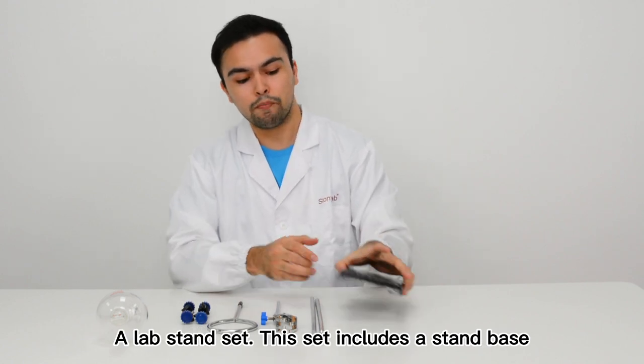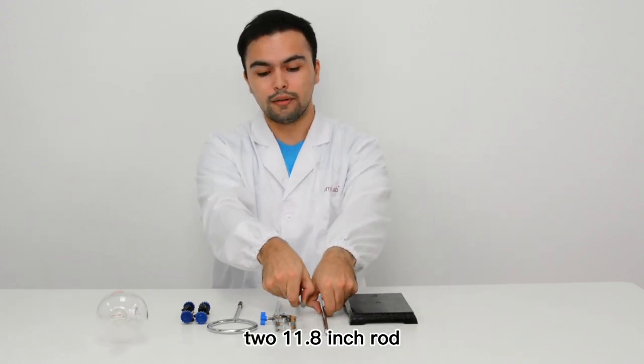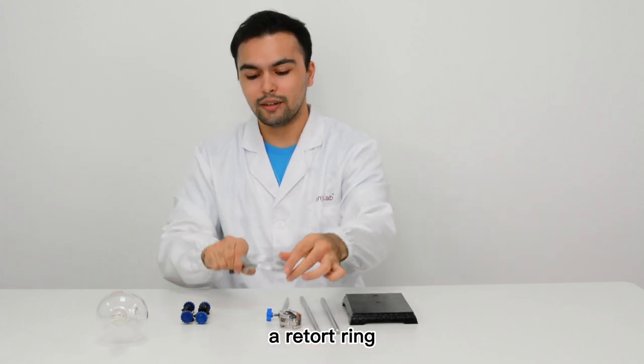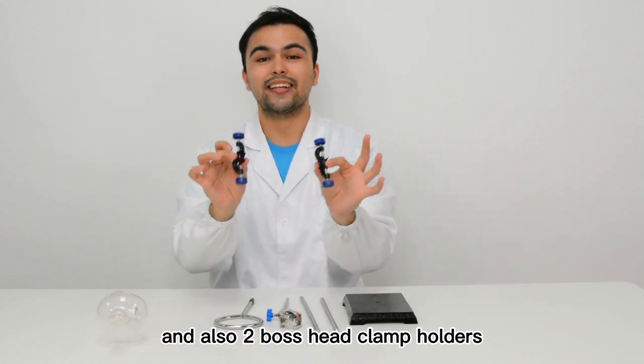Now this set includes a stand base, two 11.8 inch rods, a four prong bosshead clamp, a retort ring, and also two boss head clamp holders.